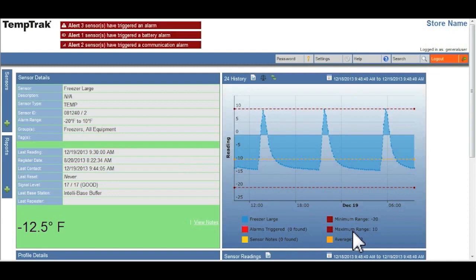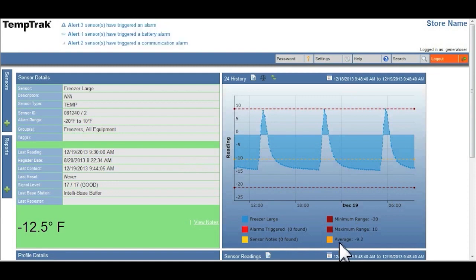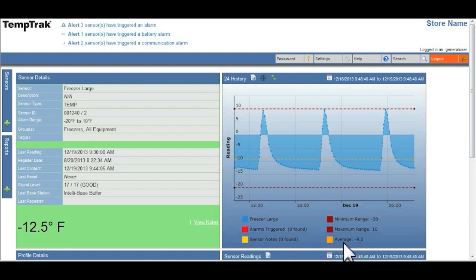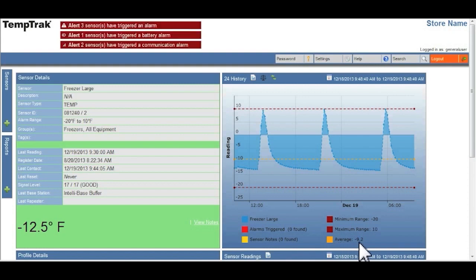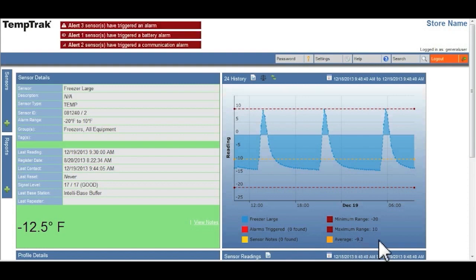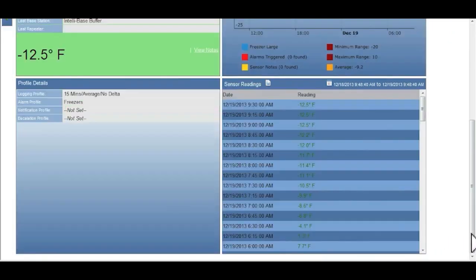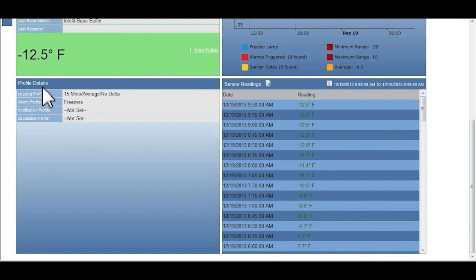The lower left hand corner is the profile details. What this does is it gives you a quick view to the different profiles that have been set up for this piece of equipment.